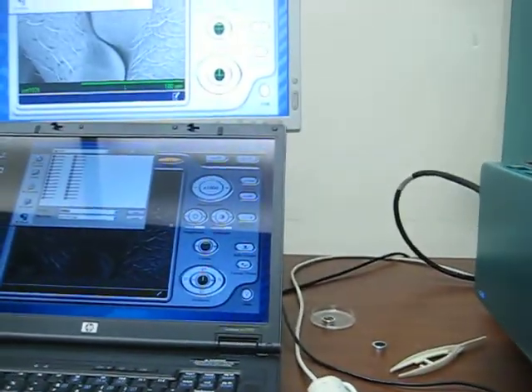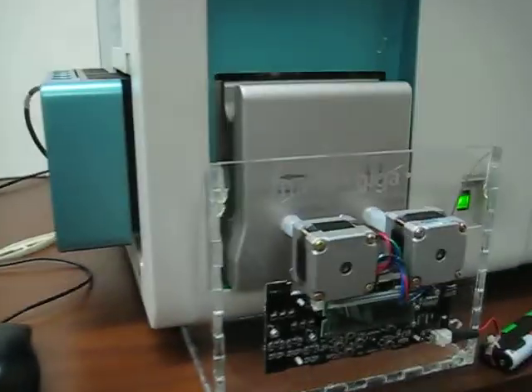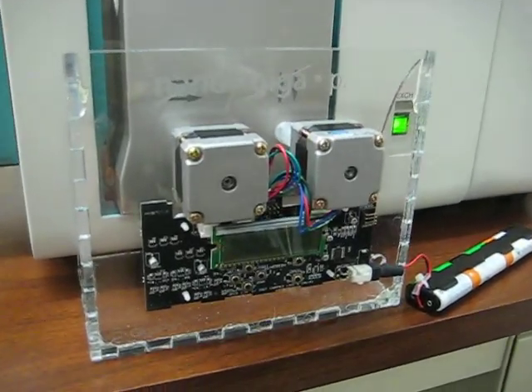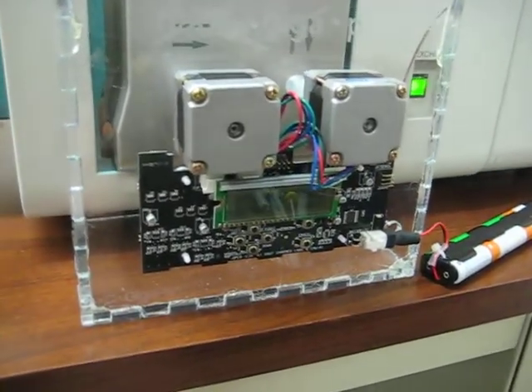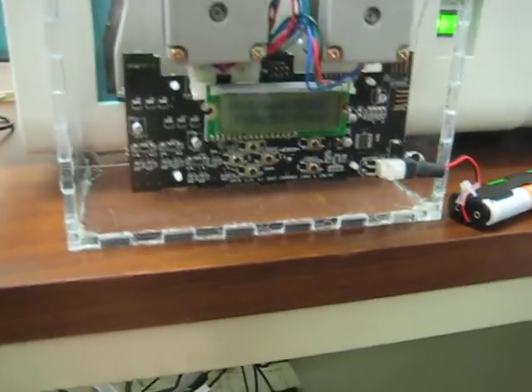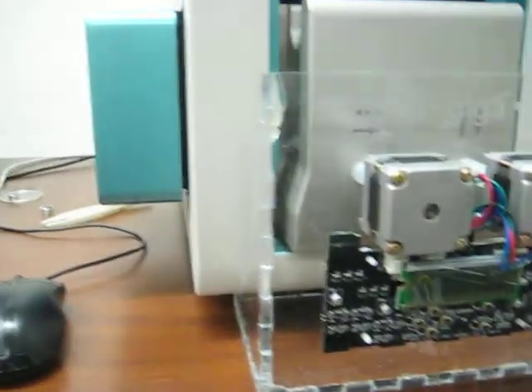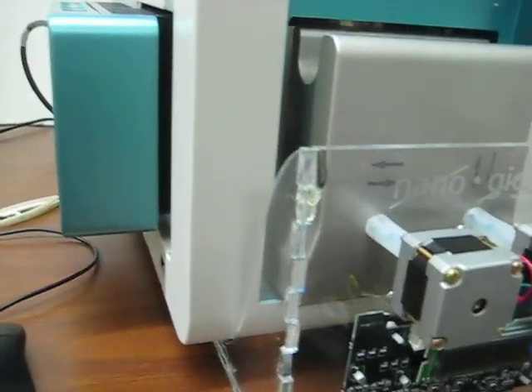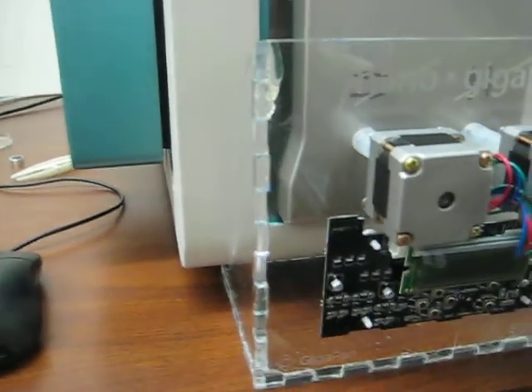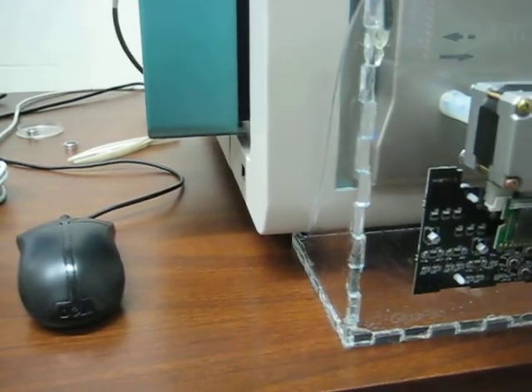So it works pretty much the same way in theory as the normal GigaPan, but rather than changing the horizon and the pitch, we're moving the sample in X and Y. You can go through the same basic functions by setting your field of view and then setting the image corners — top and left — and then progressing through the images one by one.